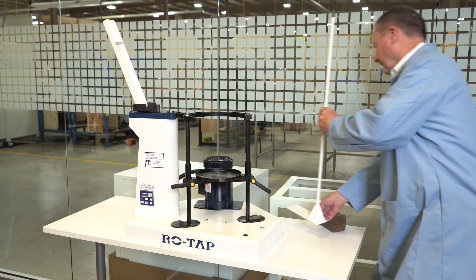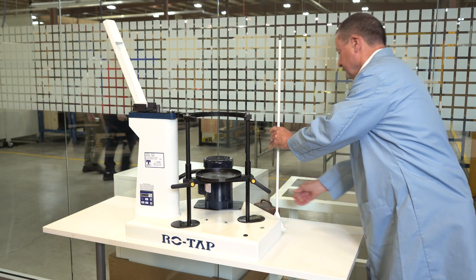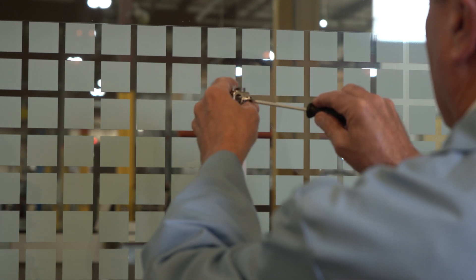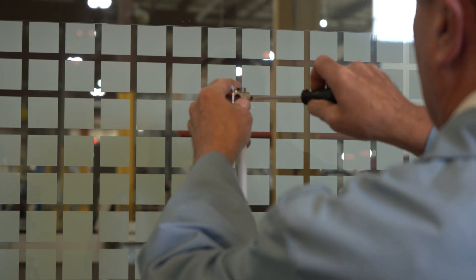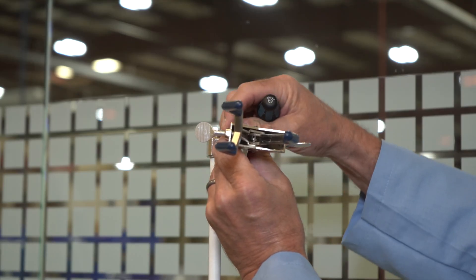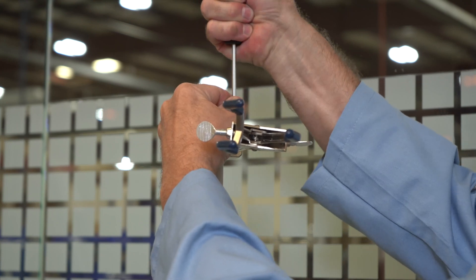Step two: the flow meter stand should be bolted to either the sieve shaker base or beside the shaker on the table. Step three: fasten the 90 degree angle connector to the top of the stand. Step four: secure the three prong clamp into the open slot on the 90 degree angle connector and position over the sieve stack.